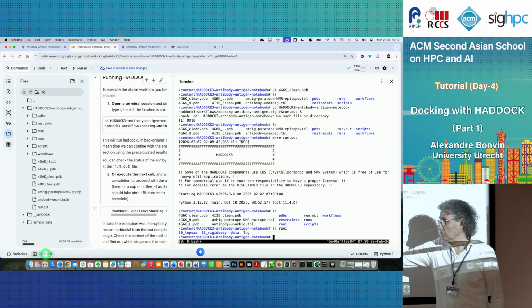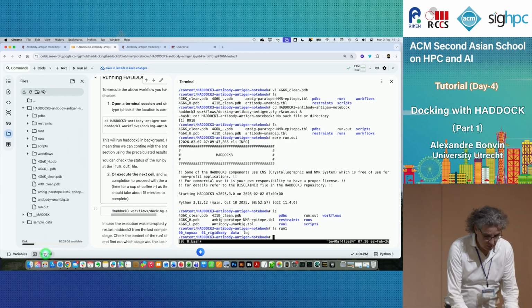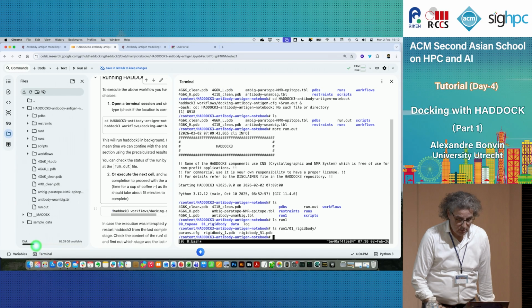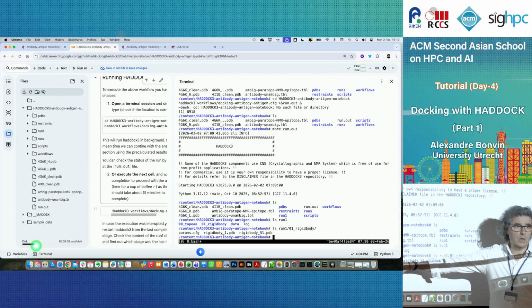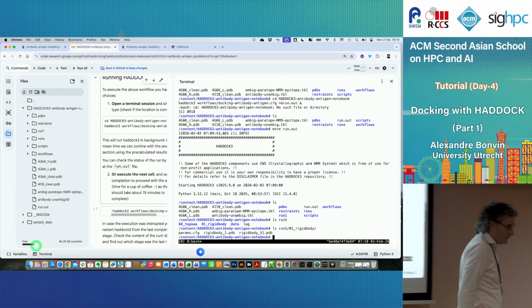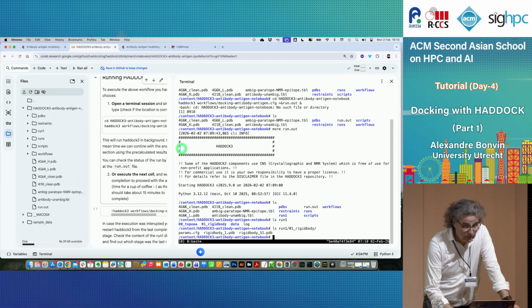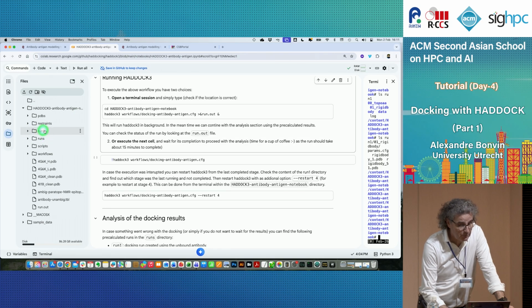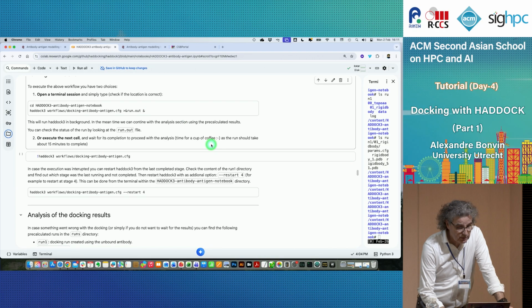Missing atoms would have been added. And now it's doing the rigid body. And if I look into run one, rigid body, you see that some more will start to appear. Okay. But I've limited CPU, so it's going to take some time. And you can also see things appearing here in your window if you open that one. So that one is running for me.